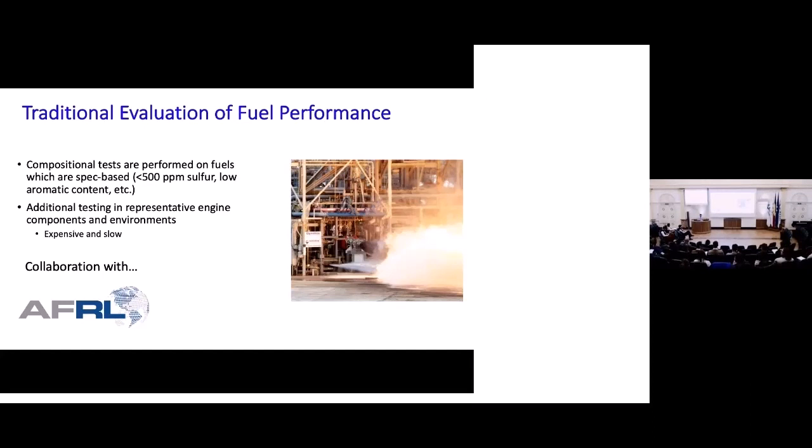We've done a lot of collaboration with AFRL in this matter, but the main idea of what we're trying to do is build up a lot of chemometric tools that utilize the GC×GC-TOFMS information in such a way that we can attack this analysis in a much more thorough way.